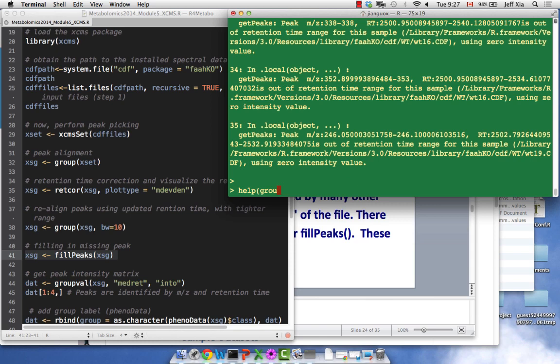Maybe help group. Is that what they mentioned? We did it really differently. We did it prior to resetting, so it's the original data. There's no copyback. Then you reset the data. This is what opened up when I did partial copyback. Yeah, okay, you can see it. We should be able to do something else. You guess the reason is you didn't install the help package.